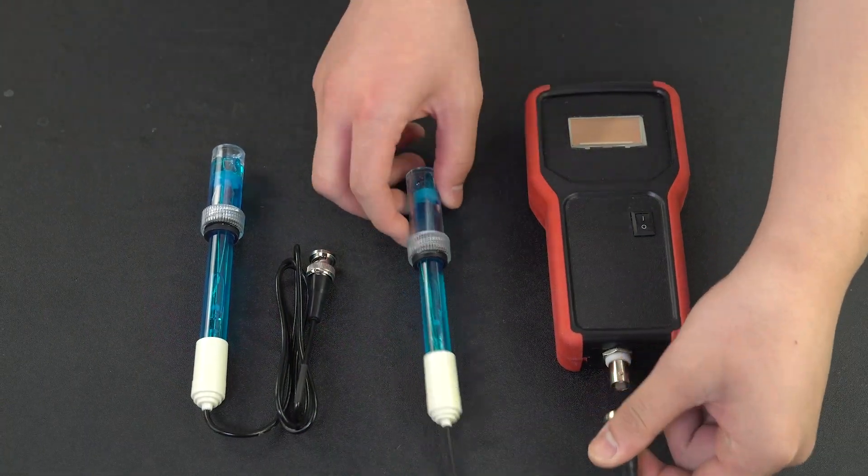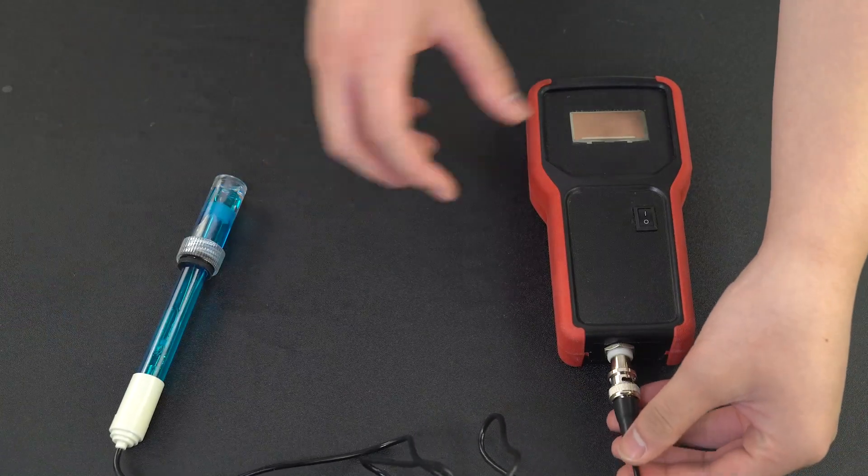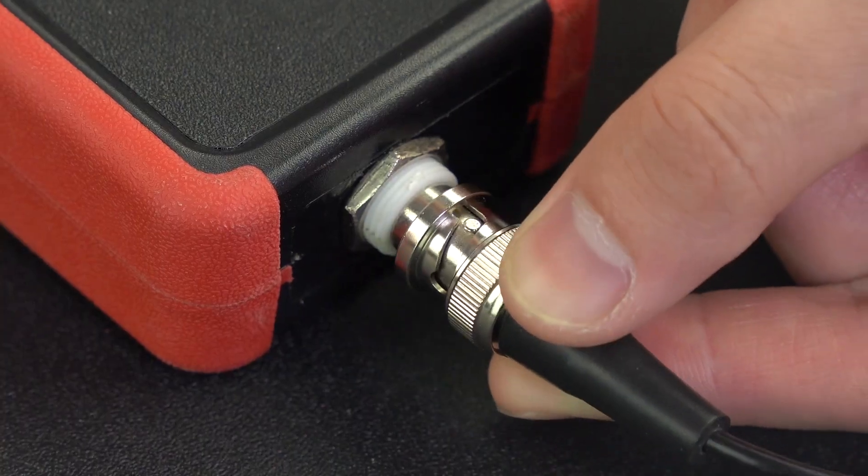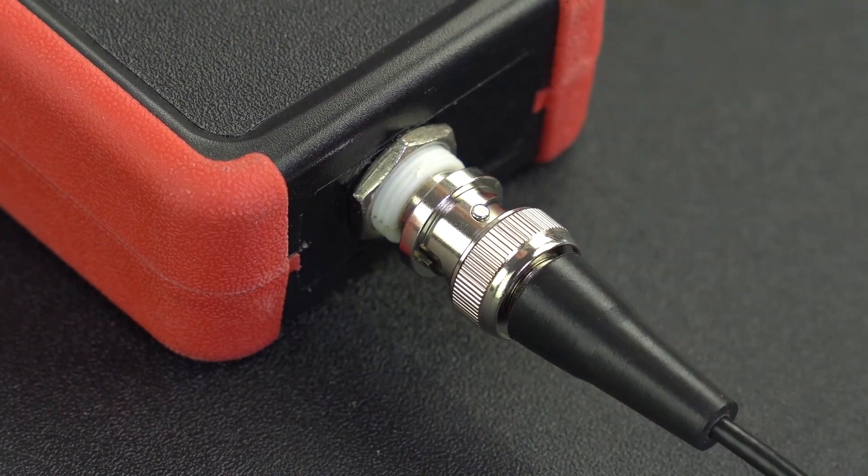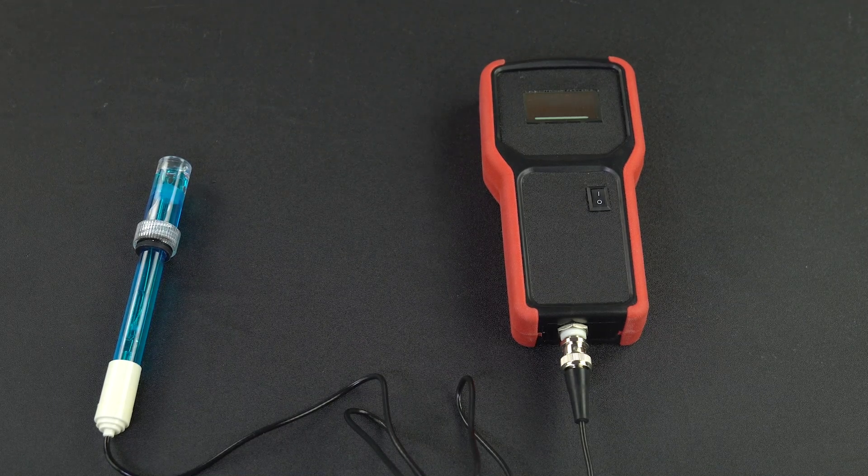So, how often do you need to replace electrodes? Well, according to our experience, it depends on your actual use conditions. Our laboratory electrodes are usually replaced after operating six months in the normal service condition.